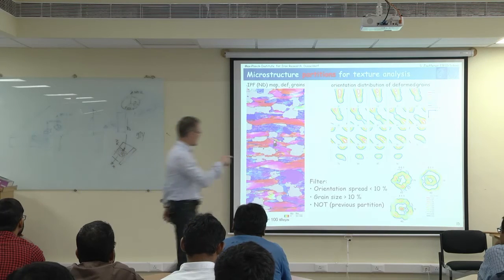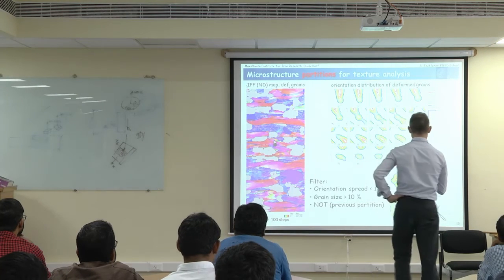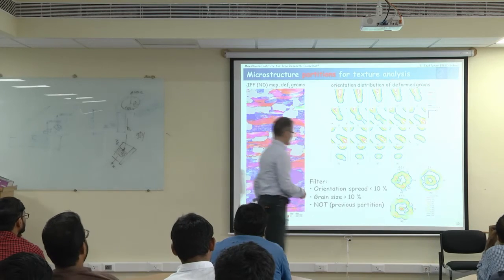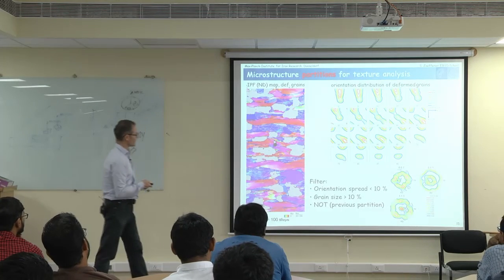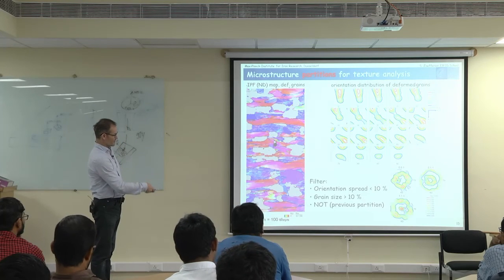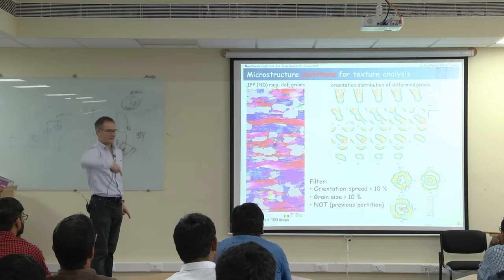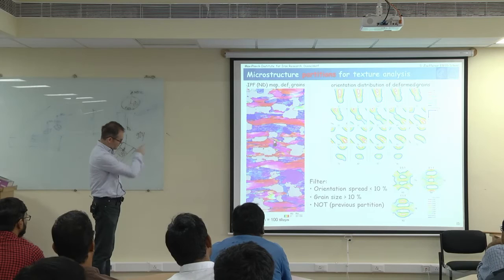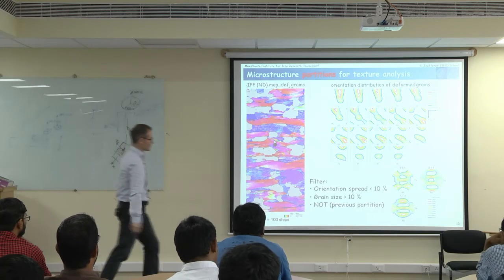But let's look again into our pole figures. So this is not yet refreshed. I was wondering, why are these pole figures not showing what I want? I need to refresh it, of course. So this was deformed grains with these funny circular fiber, and this one is now the recrystallized, and this is the deformed grains.